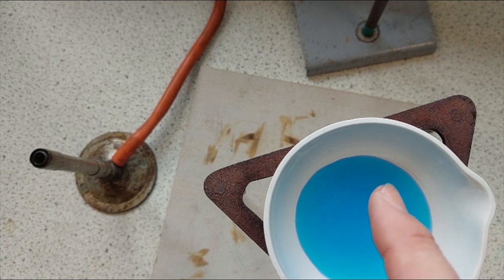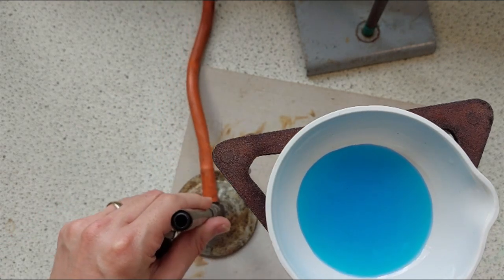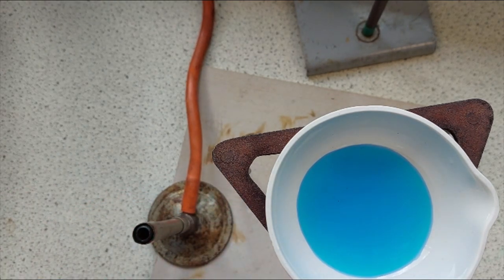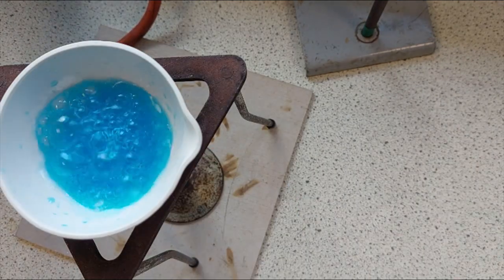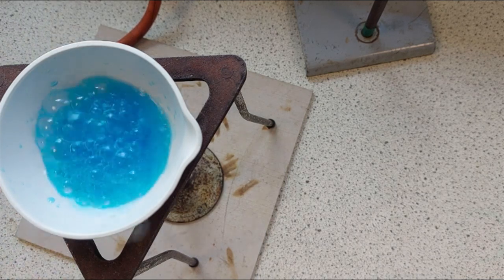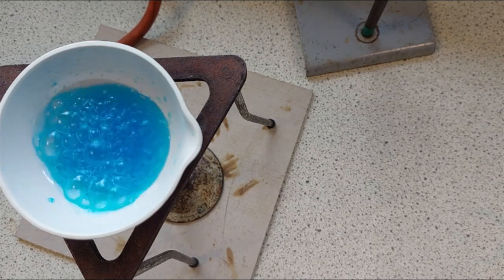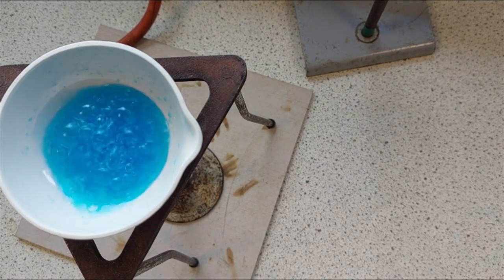I've already transferred the copper sulfate solution into the evaporating basin. I've got my Bunsen burner. We're going to light it, and I'm going to place it underneath the evaporating basin to provide the energy to evaporate off that liquid. You can see it's going nicely now. The biggest danger with this stage of the experiment is that as it begins to crystallize out and as the fluid evaporates off, it can spit quite a lot. So again, I am wearing my goggles, and already I can see some copper sulfate is beginning to form.